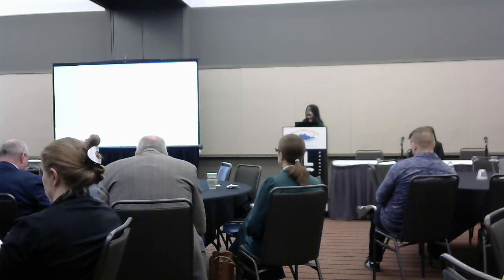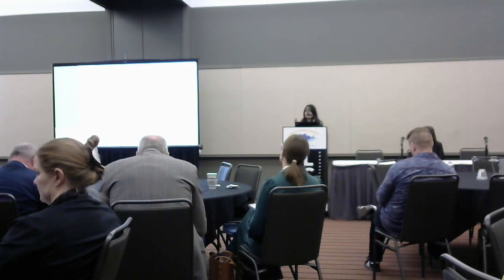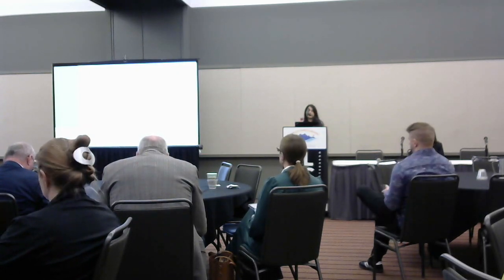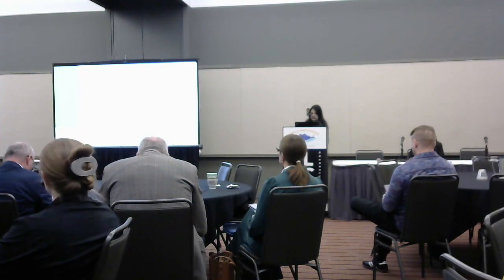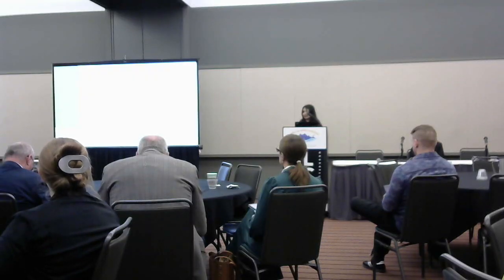And I'm not just talking about an increase in the number of images we acquire. We have also seen how these images evolve from 2D snapshots to 3D volumetric images to 4D time lapses, 5D channel multiplexing images too. And here is a list of the instruments that we have currently in the core.